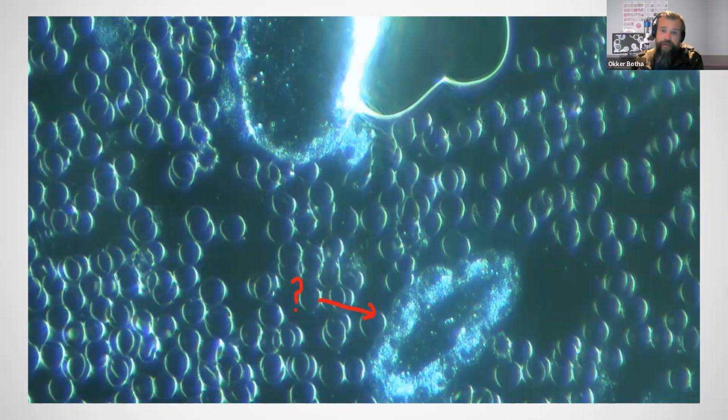Absolutely. An image like this, Elizabeth, would really tell you about the same as what you would see with bright field. There is almost no additional benefit from doing dark field in this case, because it doesn't show what we usually should be able to see with dark field. It's quite frustrating for people to work with systems like this, because you're constantly wondering what is there that you're not seeing, because it's very clear that there are things there that are simply not visible.